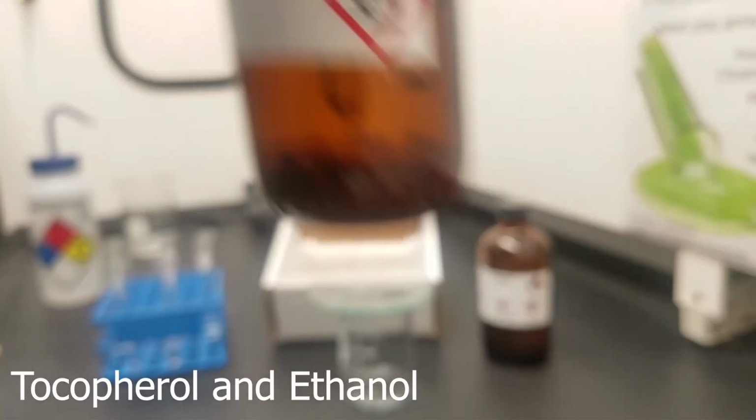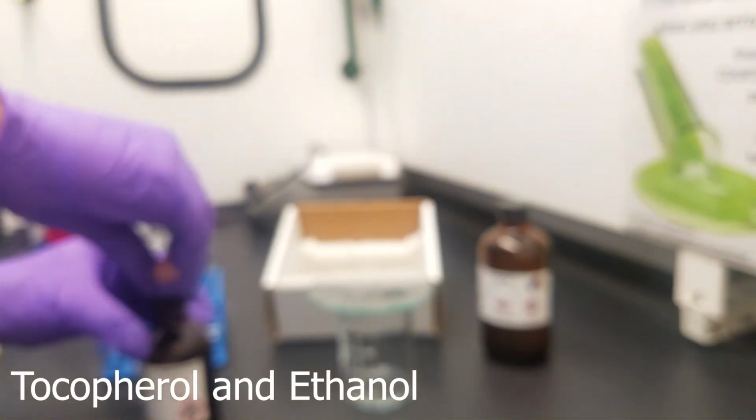Same process, dipping it in, picking some stuff up, and then putting it into the test tube as cleanly as I can so I don't get stuff stuck to the edges. And we'll start by adding our ethanol.